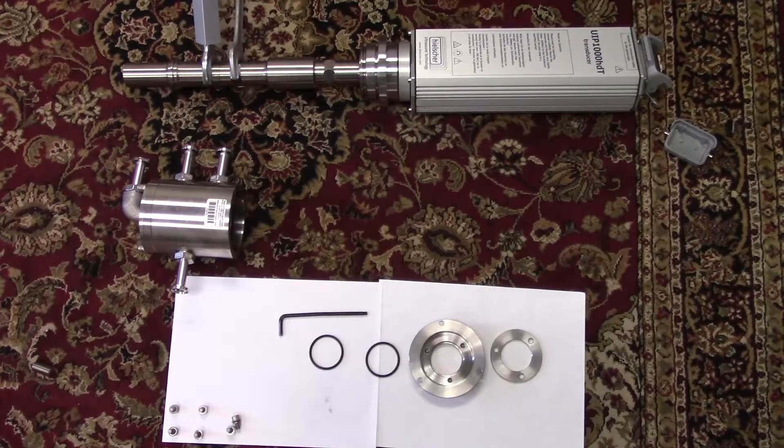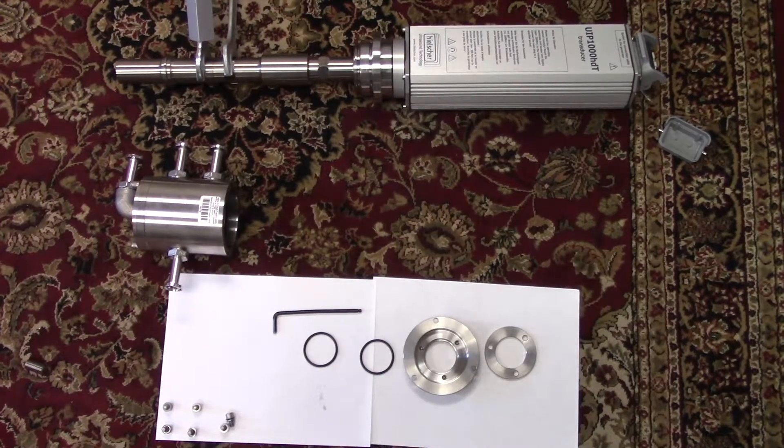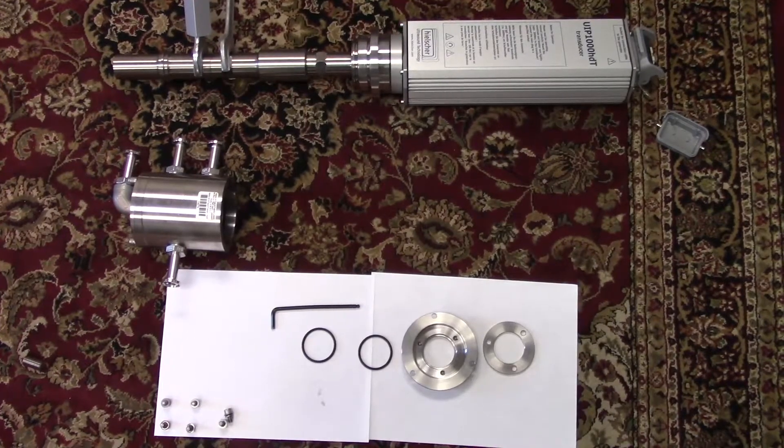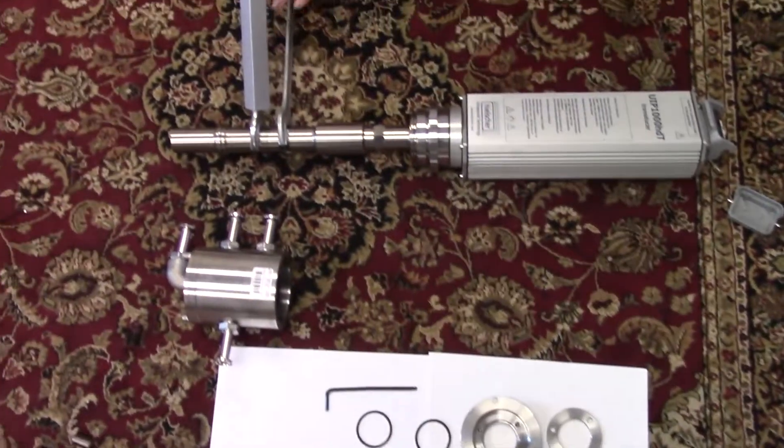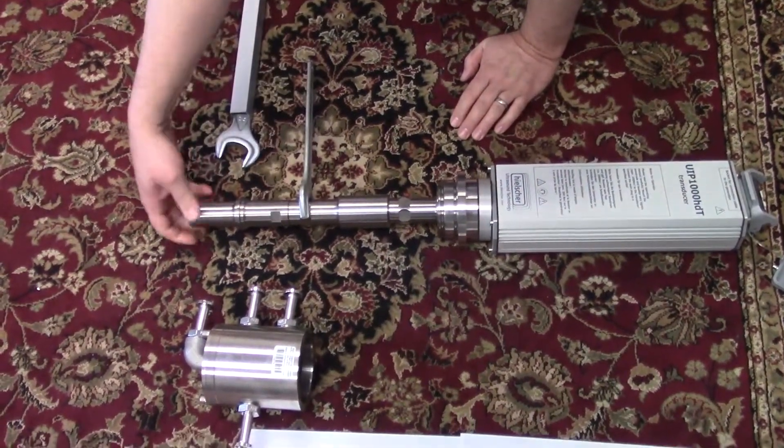Using the two wrenches and the cheater power ride, disassemble the sonotrode from the transducer, turning counterclockwise.